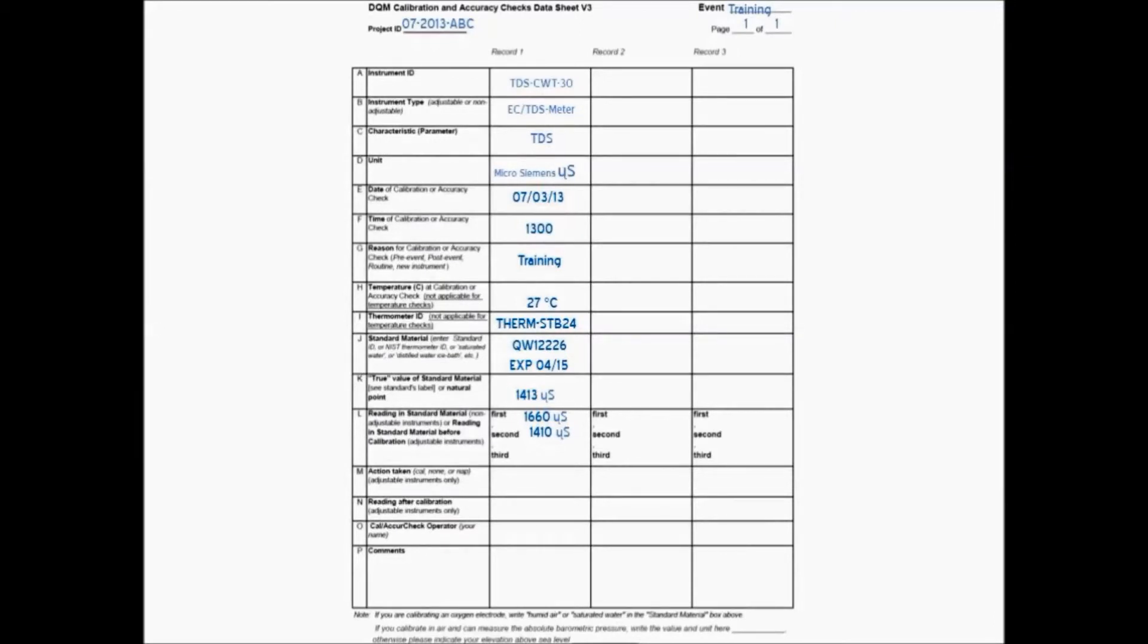And again, test against calibration solution to ensure that the meter is calibrated correctly. Record this third value as well.